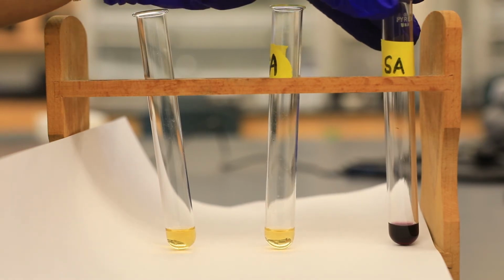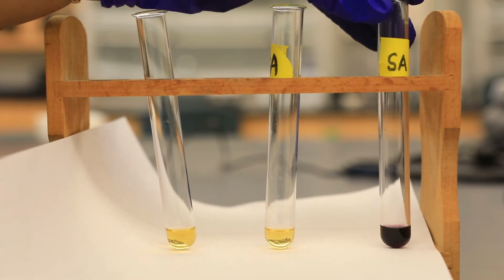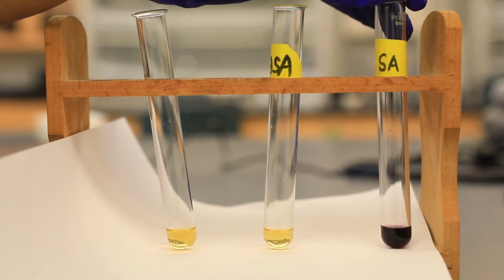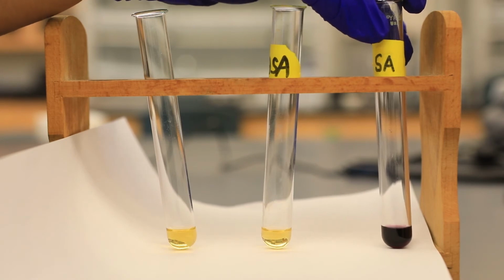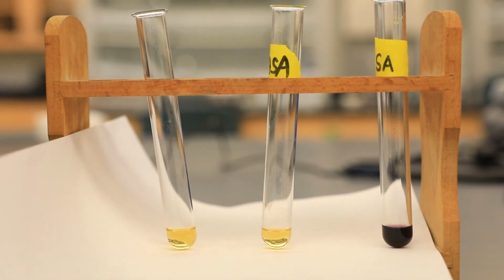And then in the third test tube, what we also have is ethanol, that 1 drop of iron(III) chloride, but I've already gone ahead and added the salicylic acid. Now, salicylic acid is a phenolic compound, so you have that aromatic ring with that OH group, and so what you'll notice here is the formation of that deep colored complex.